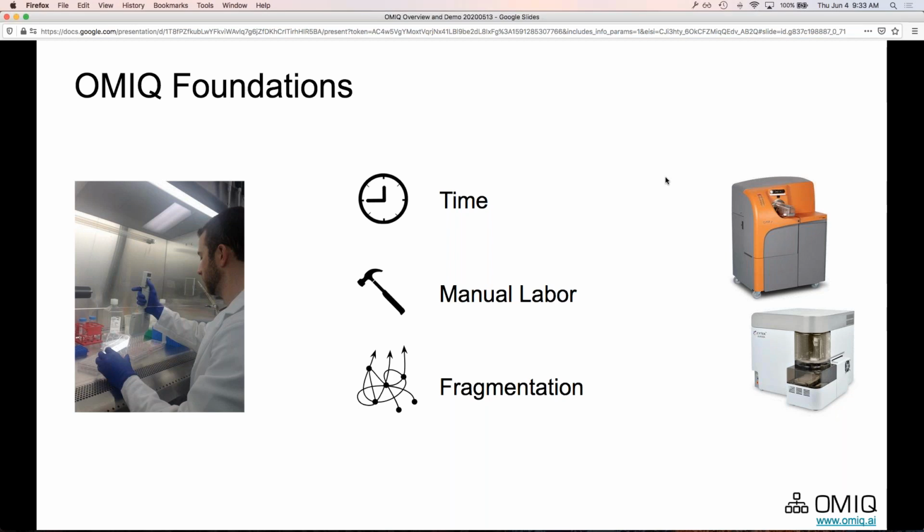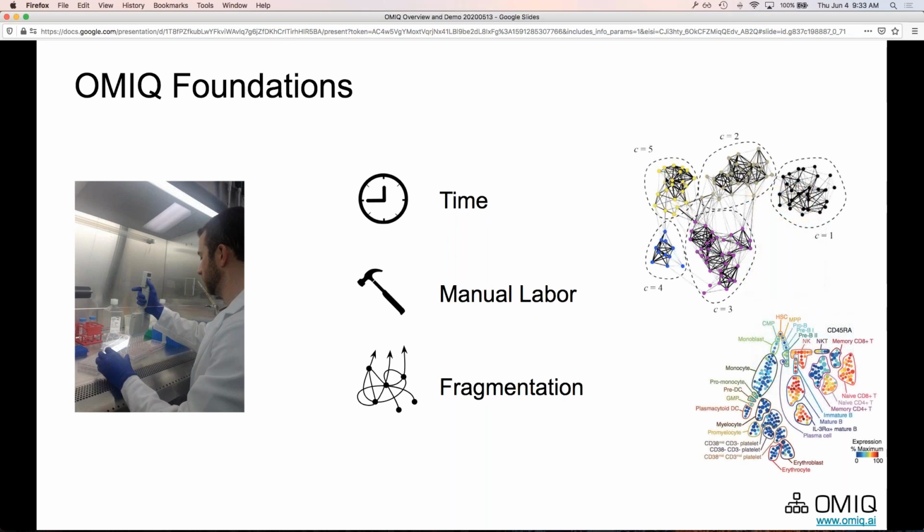And then, of course, we had this influx of new ways of looking at data, right? There was this introduction of high dimensional analytics. Myself at the time, and I think a lot of scientists even these days, don't understand this too well. It's often a novel and mysterious concept, but it's very important, right? It's not only useful, but necessary in order to help you get the most out of your data and not miss anything that's happening.